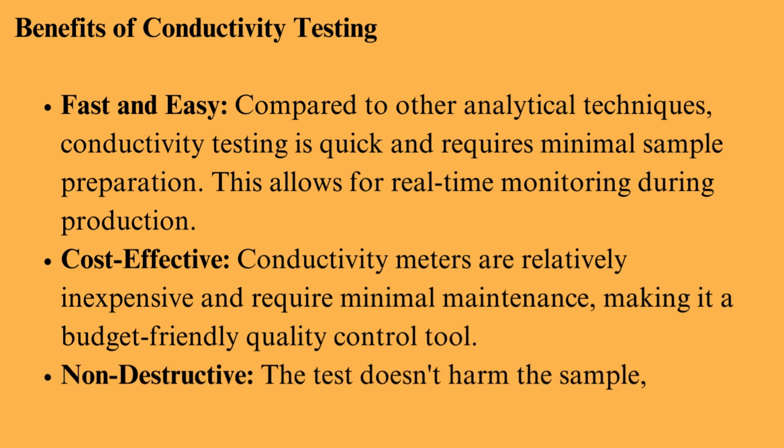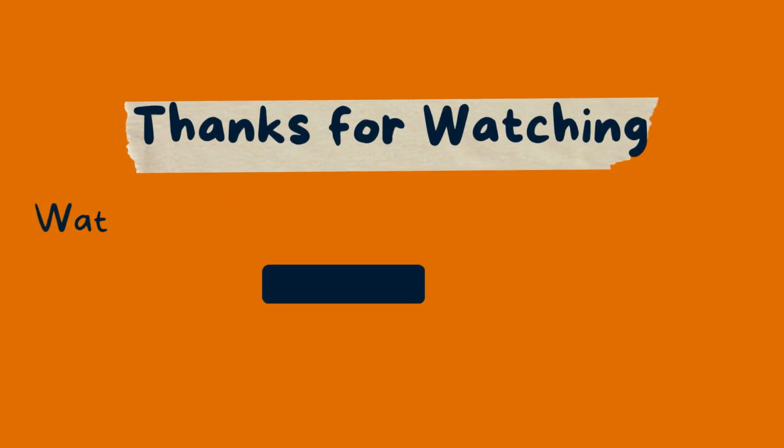Non-destructive. The test doesn't harm the sample, allowing for further analysis if needed.